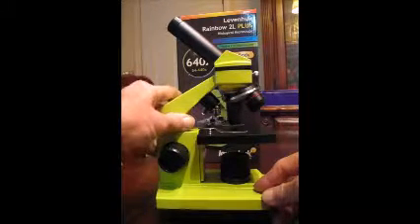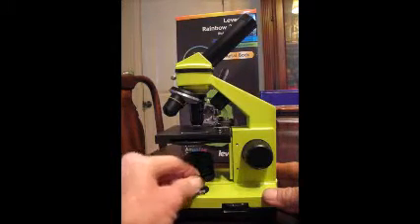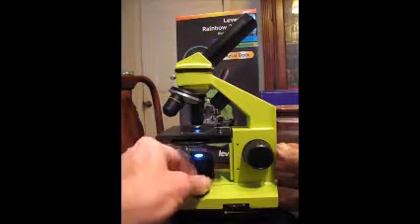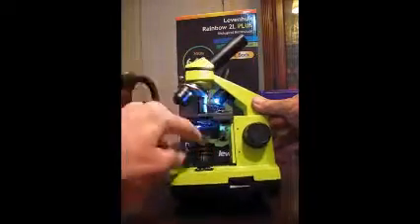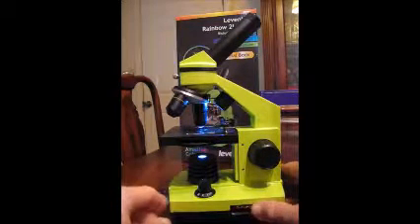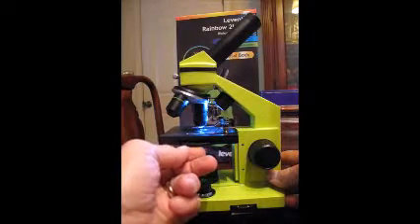What really makes this microscope stand out over others is the lighting — you have both upper and lower lighting. The dial is like a master control: position one gives you lower lighting only, position two gives you upper lighting only from the LED up top, and position three gives you both top and bottom lighting. Once you've chosen your mode, a separate switch lets you rotate to control the intensity. There's also a diaphragm that rotates like a turret, with different size openings to control how much light comes in from the bottom.